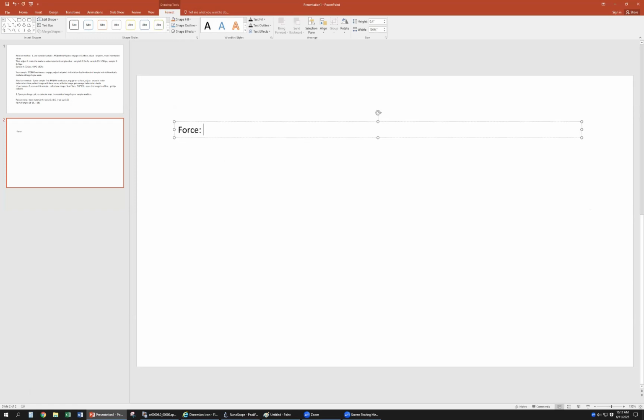Okay, so for the force curve collection method, we collect the force curve. You can get the force curve in three kinds of workspace. One is contact mode with a ramp. Then another one is ScanAsyst with a ramp.